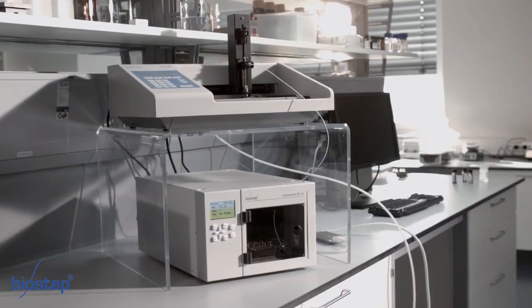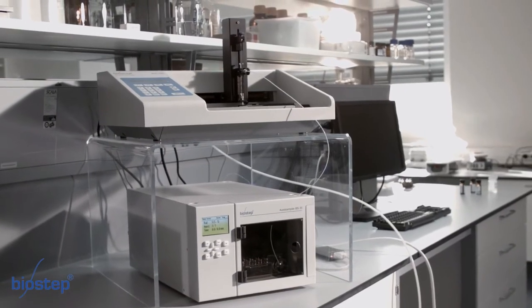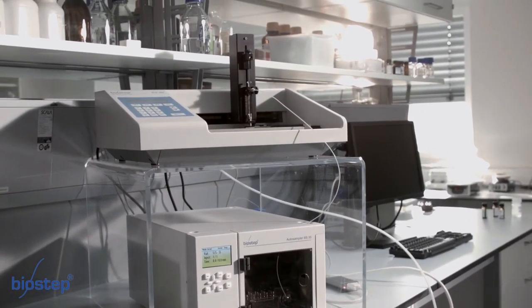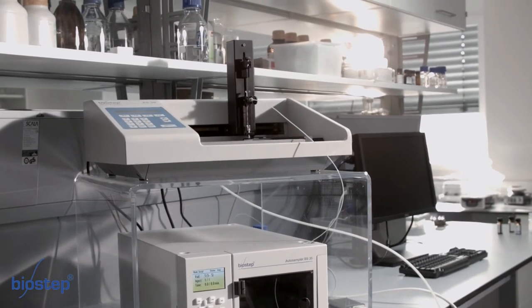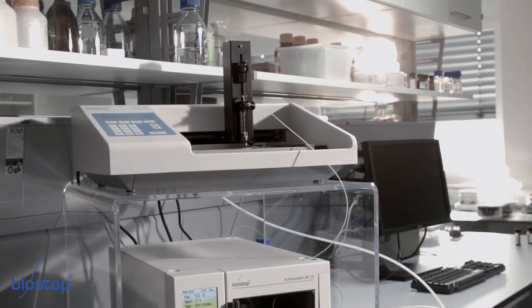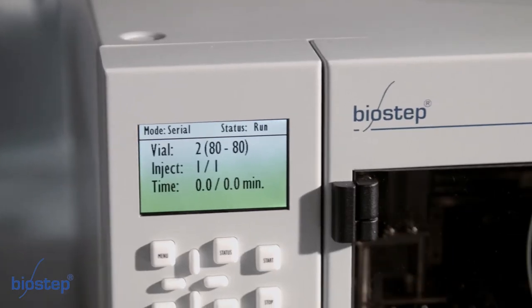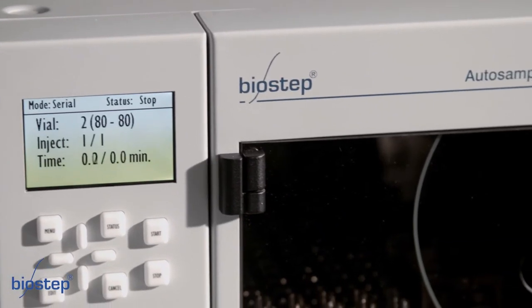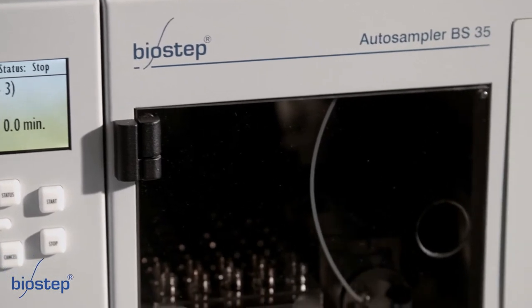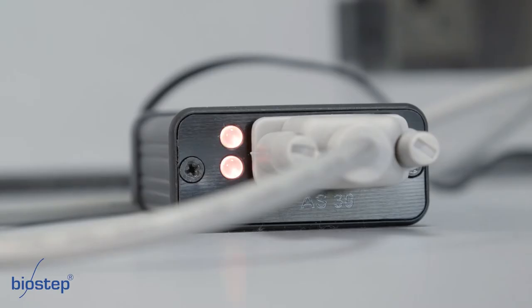Here you can see the space-saving arrangement of the instruments. On top is the HPTLC applicator AS30, sitting on an acrylic rack. Below there is the auto-sampler BS35. The communication between both instruments is carried out by an interface box.